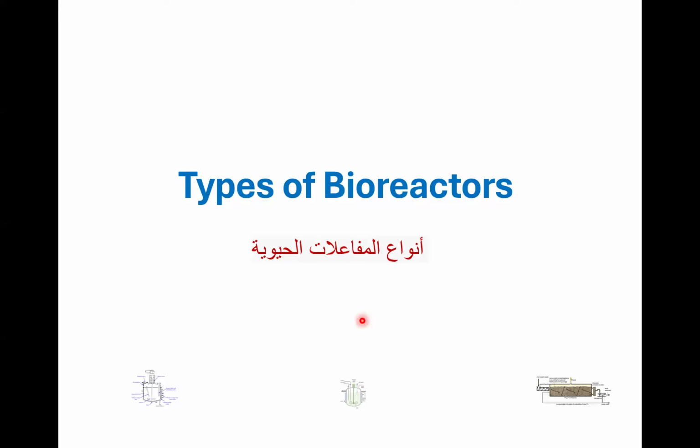Hello everyone. Today I'm going to introduce the types of bioreactors. This is actually a very simple introduction to the topic, but sometimes students might not be able to distinguish between these common types of bioreactors.